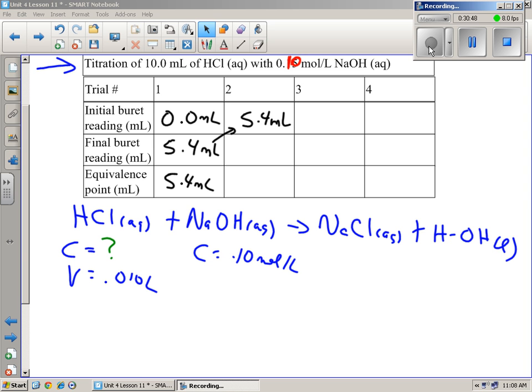Labs are 4 hours at university, right? You don't want to be spending 4 hours. That's a long time. So you want to get through this and get a ballpark number. And then after is when you want to be very careful. I'll tell you this: every drop that you let go out of this burette is about 0.1 of a milliliter, and you need to be within 2 drops every time. Okay? Within 2 drops. So it's not a lot of error.